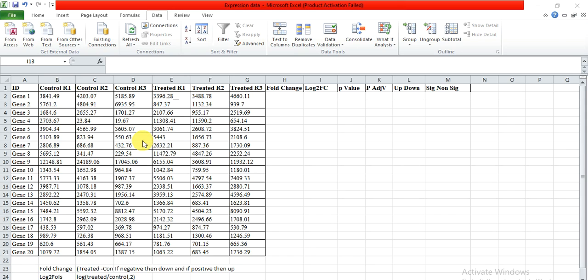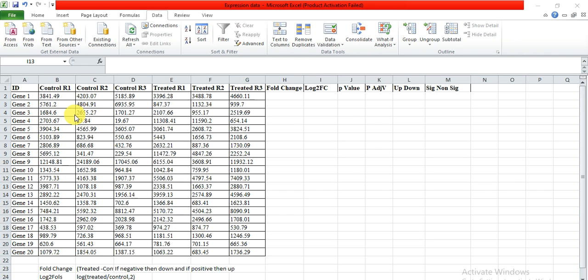Let's start. For example, this is my data — this is the gene list, this is the control, and this is the treated sample. These are R1, R2, R3, or replication 1, 2, 3, and these are the treated samples with replication 1, replication 2, and replication 3. These are the PKM values. You can also use this data for physiological parameters like plant height, root length, shoot length, and compare them with control to treatment.